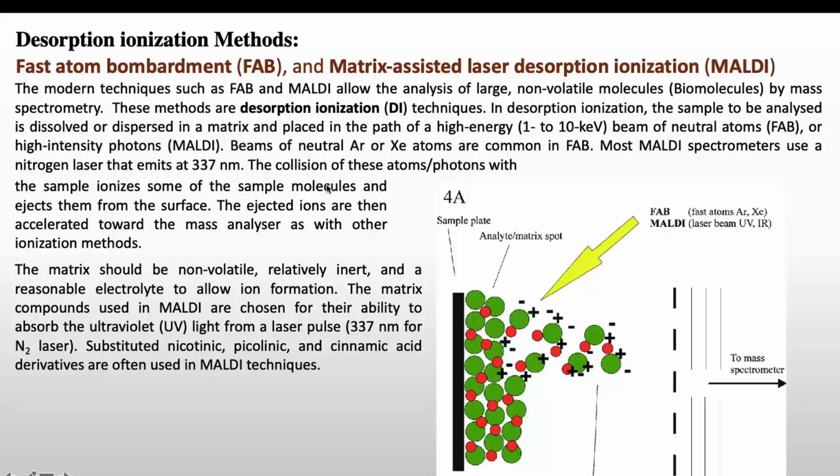Now the collision of these atoms or photons with the sample ionizes some of the sample molecules and ejects them from the surface like in this way, and the ejected ions are then accelerated toward the mass analyzer as with the other ionization methods. So it's very simple: you just load your sample on the matrix and bombard it with the beam of neutral atoms or photons, then they will be emitted and ionized in this form, and then they will go towards the mass analyzer as we have discussed in previous methods.